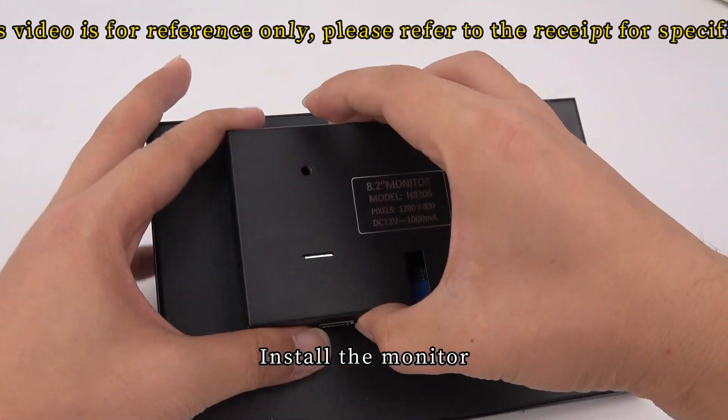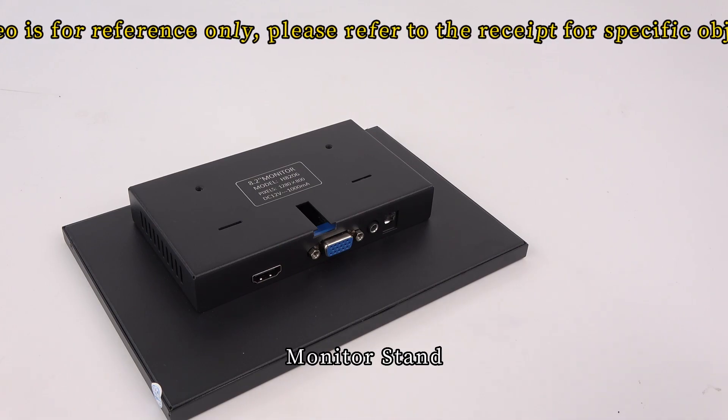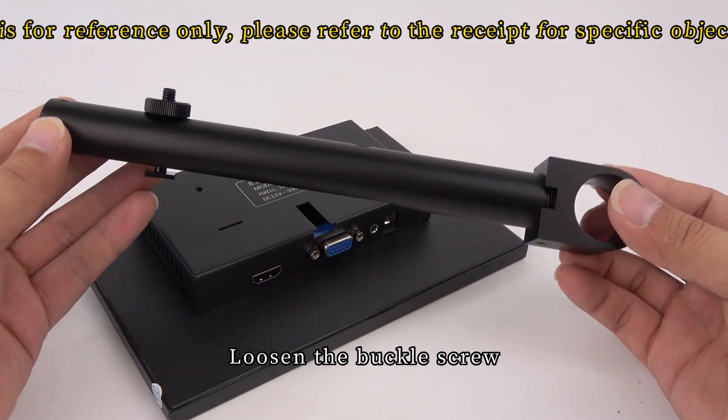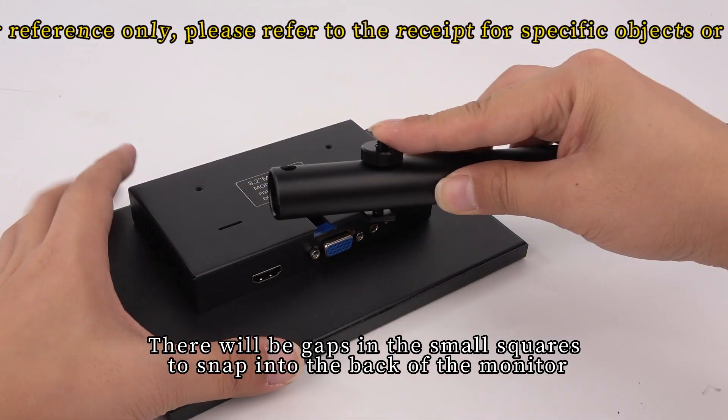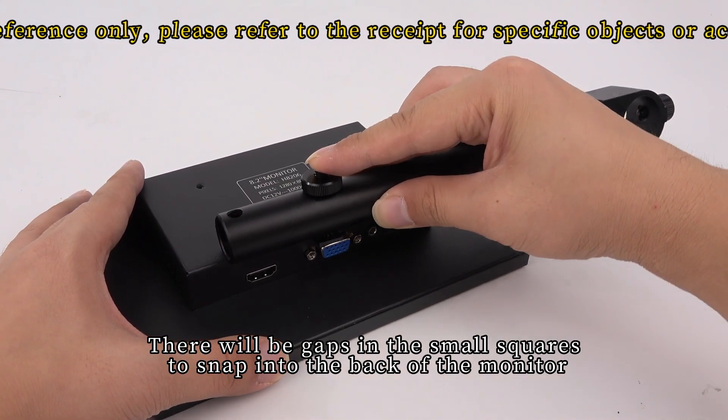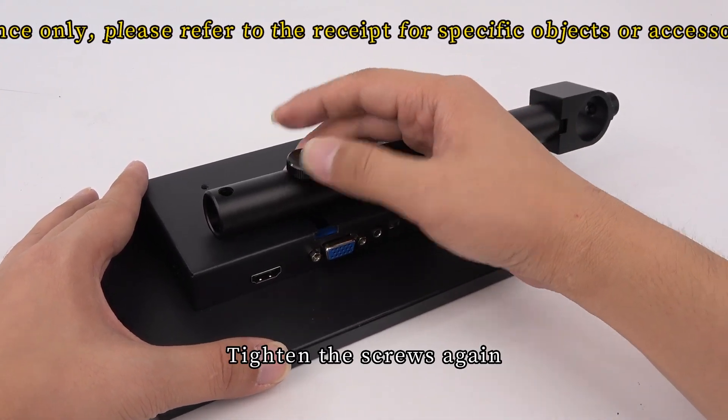Install the monitor on the monitor stand. Loosen the buckle screw. There will be gaps in the small squares to snap into the back of the monitor. Tighten the screws again.